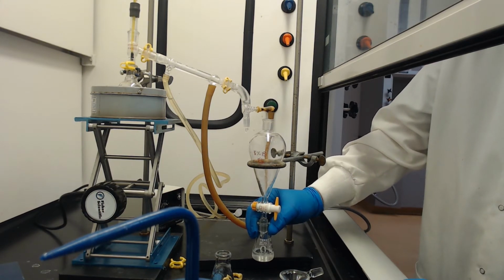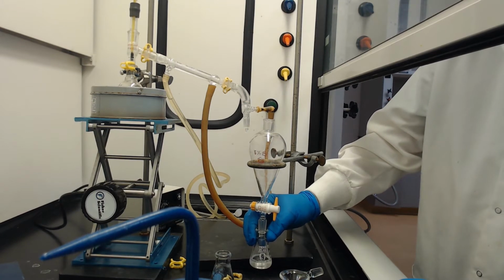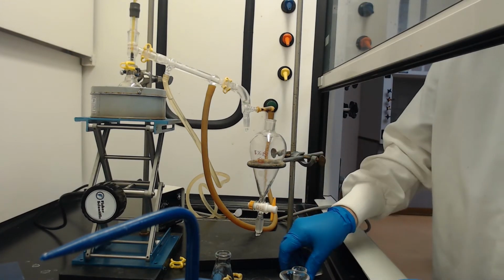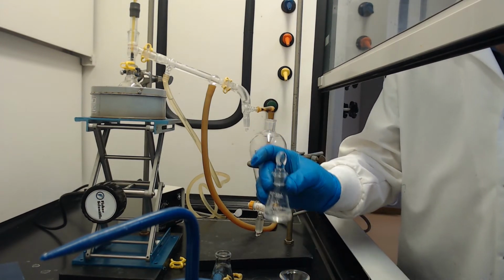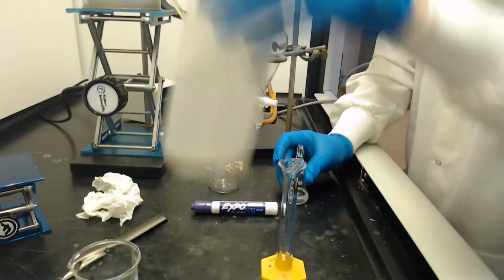Our 25. So this is a decent yield, because we started off with, I don't know, 10 to 12 milliliters, and I've got, this is above the 10 milliliter. Now here, that stopcock will actually work for a top for that. We could also use a watch glass for that. Let's get that out of the way.